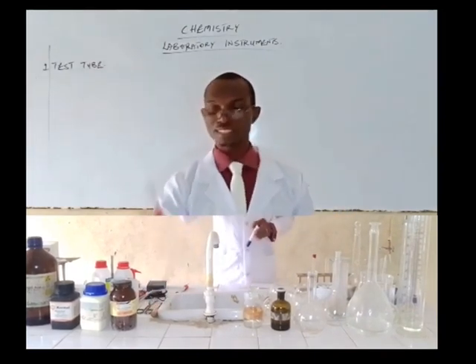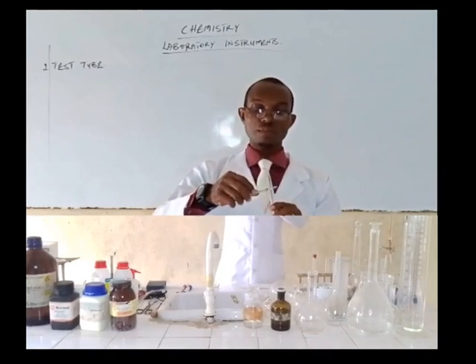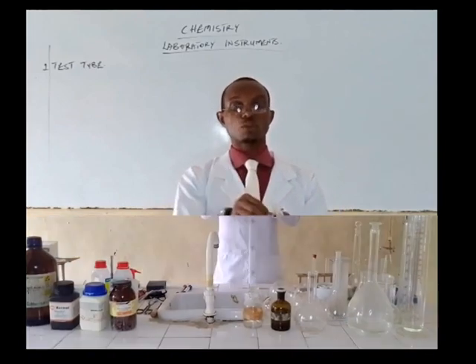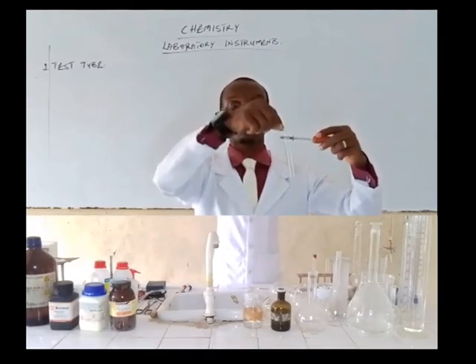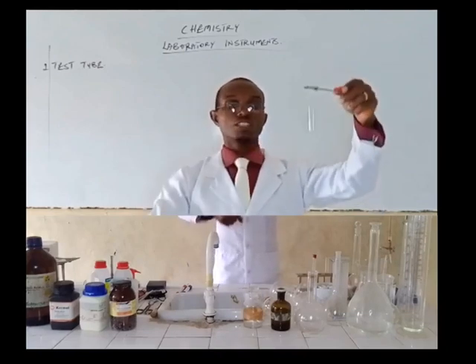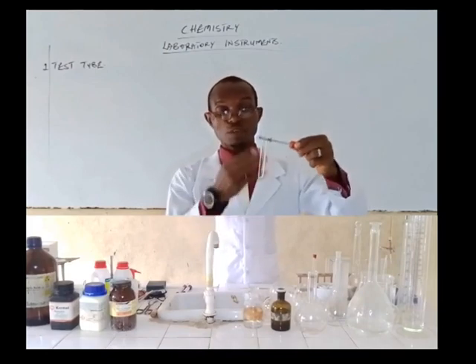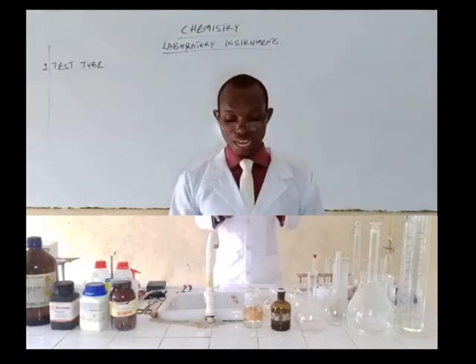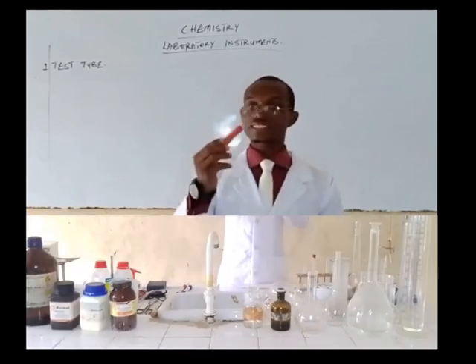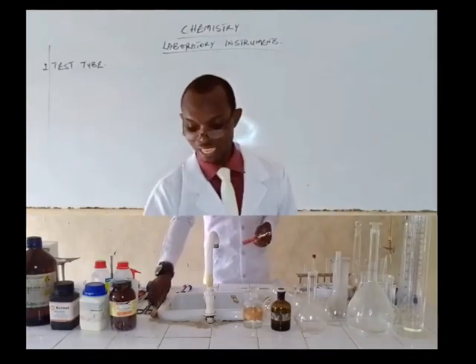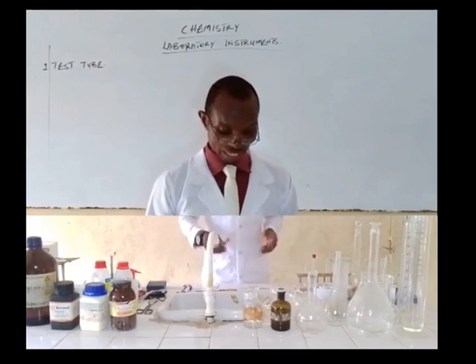To use our test tube effectively, there is what we call the test tube holder. We use it to hold our test tube, preventing whatever chemical you are working on from pouring on you. In case you have to pour some corrosive chemicals into the test tube, you use the test tube holder to hold it, preventing the chemical from spilling or splashing on you. These test tube holders are of different types — one has a plastic or rubber handle, while another type has wooden handles.